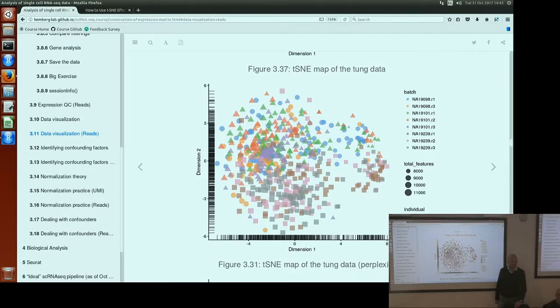So I hope you got some messages from these two chapters. There are some subjective steps in your analysis. Here we represent our subjective opinion about t-SNE, but it's not just objective. I mean, you can run it yourself. You can see that sometimes it doesn't really work as you want it to. But our main idea is just for you to know that and to treat t-SNE and PCA accordingly in the future. Any questions?